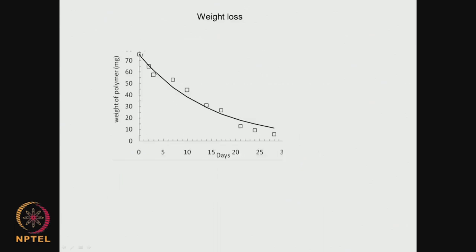If the material is losing weight, you may end up having a relationship like this. The weight loss as a function of time will be going down, maybe as a first order or maybe as a half order, and so on. Again, this data is very useful, especially if you are looking at drug delivery systems.